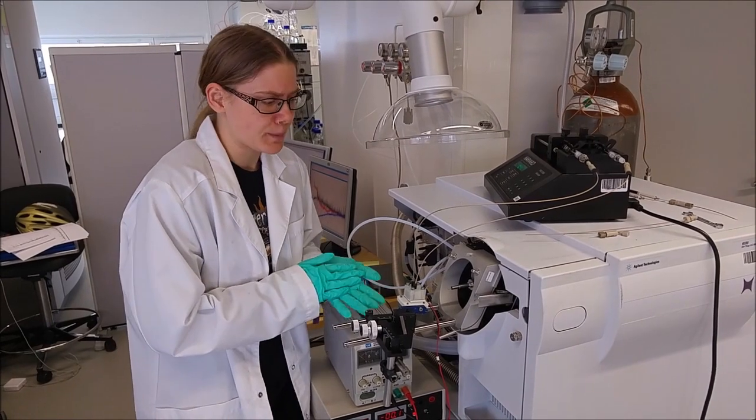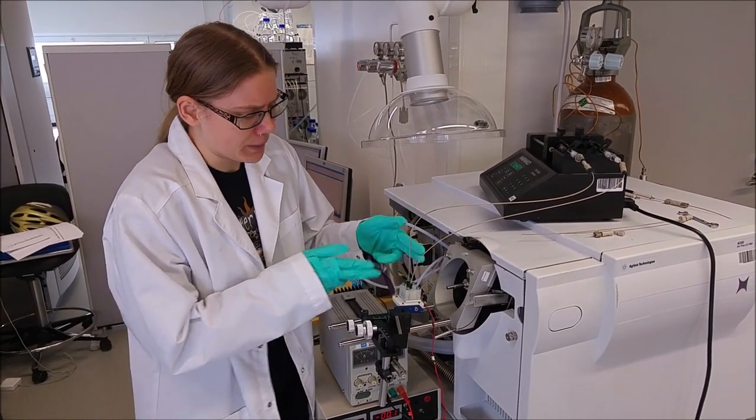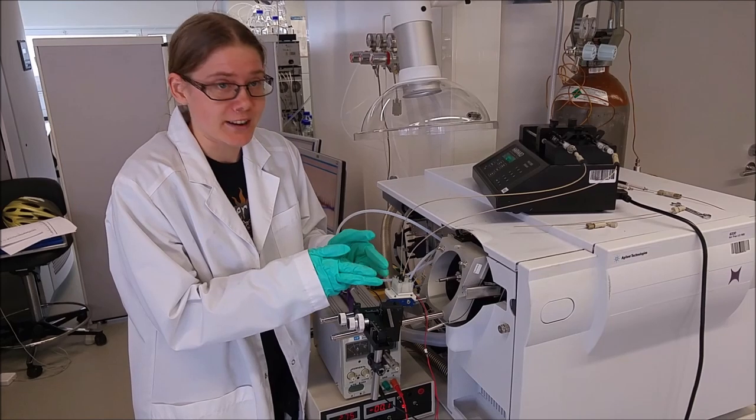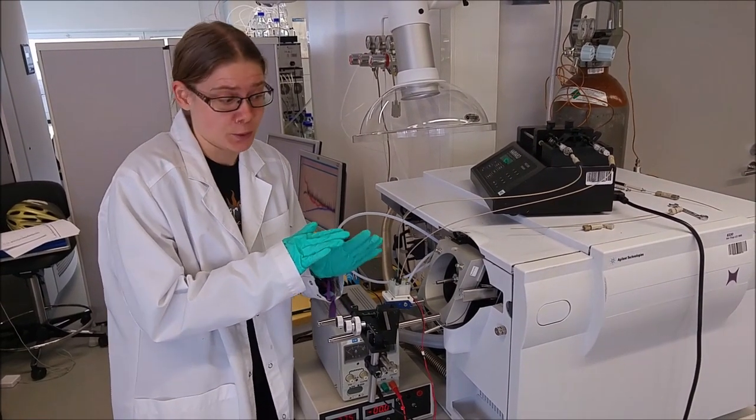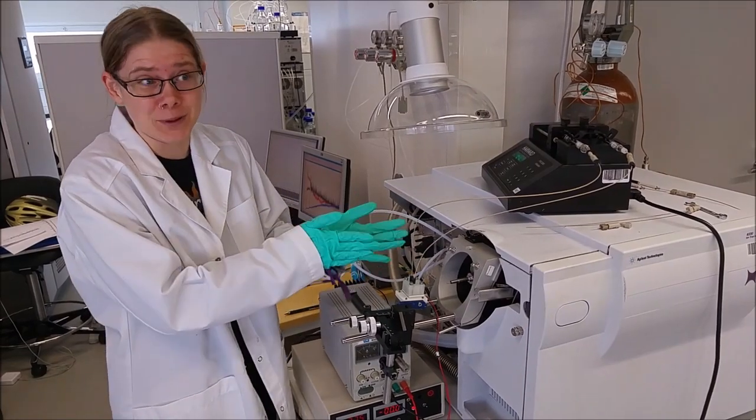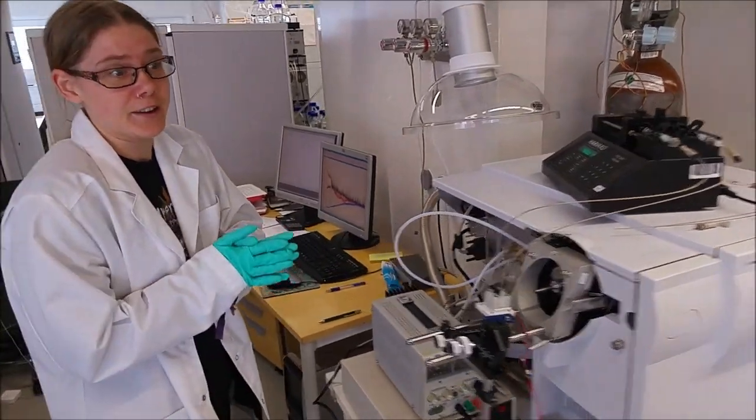By recording a mass spectrum and by the electrospray here we are pulling the liquid from the reaction chamber. So we don't need any external pump or so to get the liquid into the mass spectrometer and analyze it.